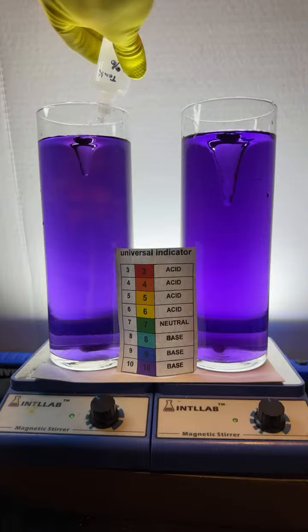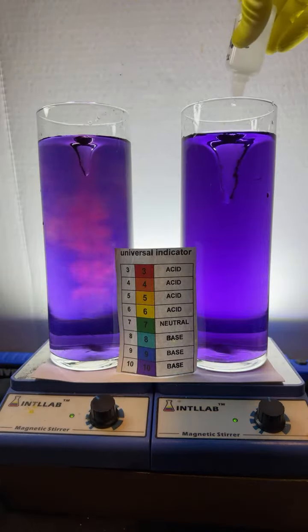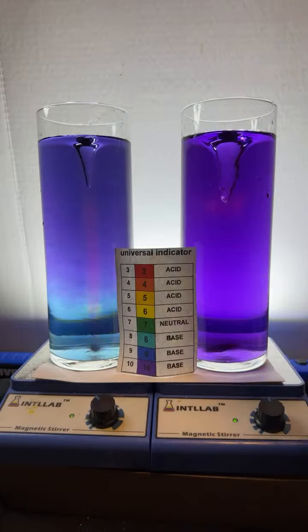Over here on the left, I'm adding a drop of hydrochloric acid. Over here on the right, adding a drop of hydrochloric acid.